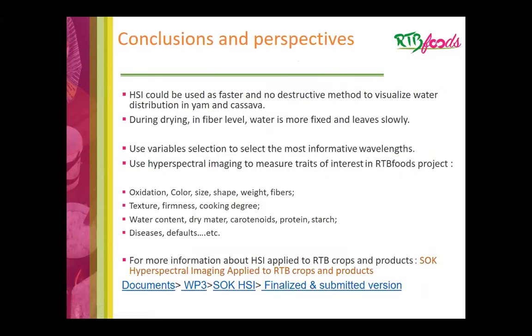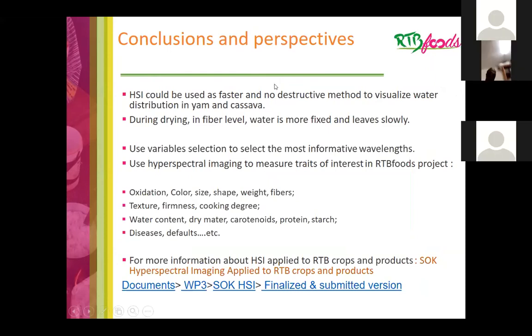For conclusion and perspective, this study shows that hyperspectral imaging could be used as a fast and non-destructive method to visualize water distribution in yam and cassava.